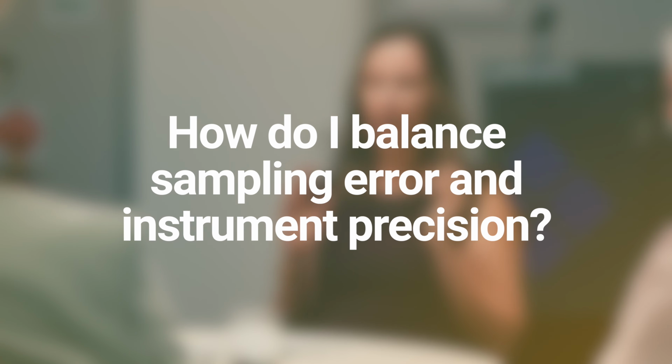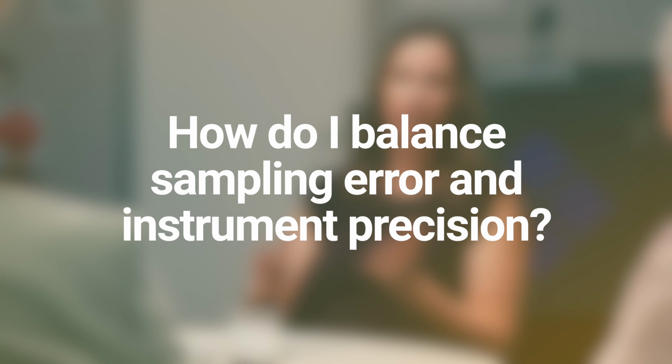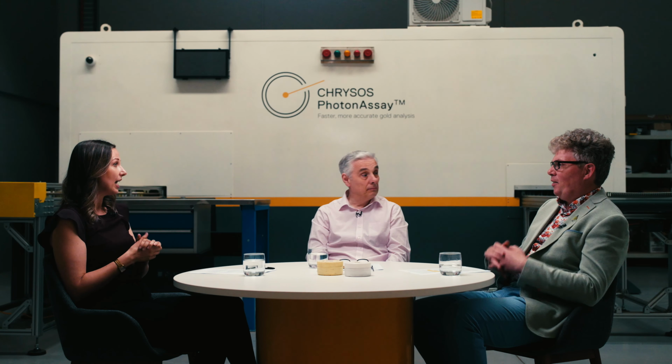And the thing with those low-grade samples, when we talk about precision, we're talking about total precision, so you're talking about sampling error in combination with instrument error. Sure. So it's always interesting because yes, we have a higher instrument error at that point, but PhotonAssay is measuring a much larger mass, which means that we often find, especially when we do studies on these kind of things, when we compare the results of total precision between a crushed PhotonAssay, a pulverized PhotonAssay, and a fire assay result, crushed PhotonAssay is usually very close to the fire assay, with a pulverized PhotonAssay either producing a similar result or a better result, even at lower grades.